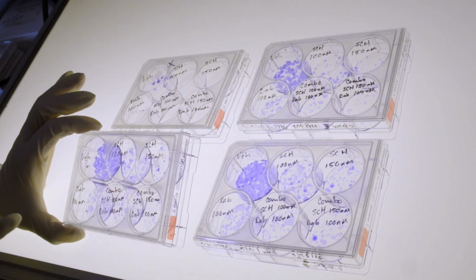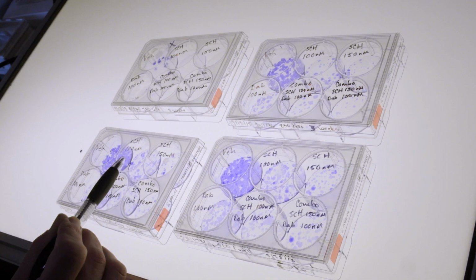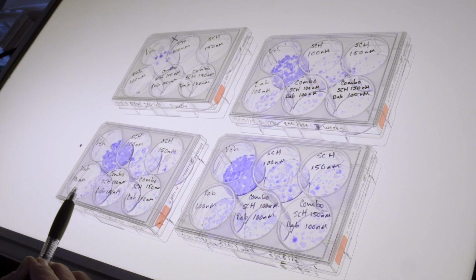Colony formation is inhibited pretty well. Good. We can test the BC-PAP cells. Cell lines are really the workhorse of biomedical research. Having the right cell line models is critical.